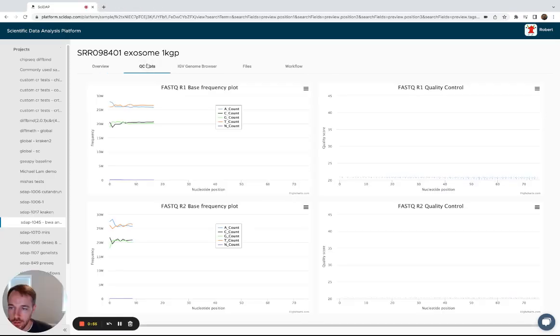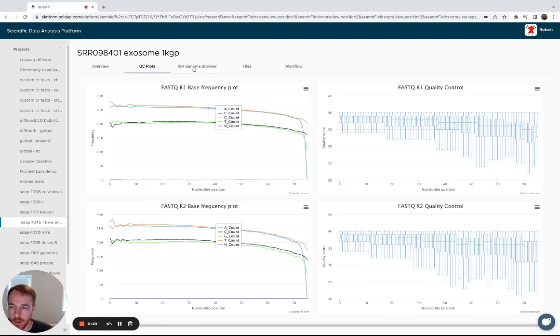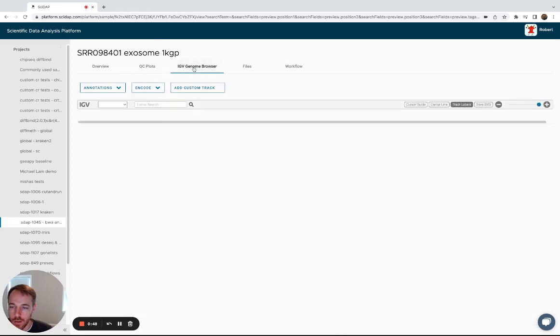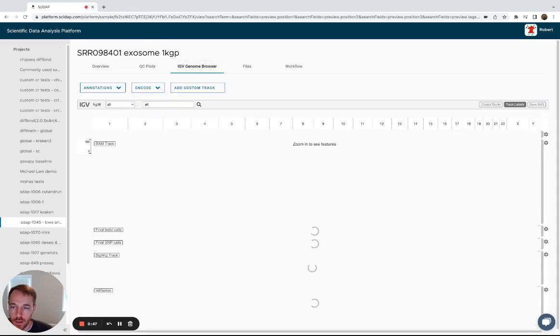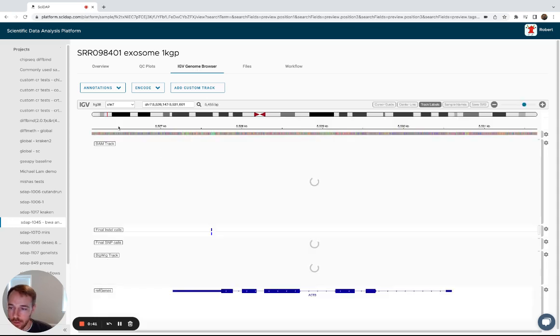We also provide base frequency and base quality plots here, and IGV genome browser where you can go and look at the BAM tracks for all across the genome.